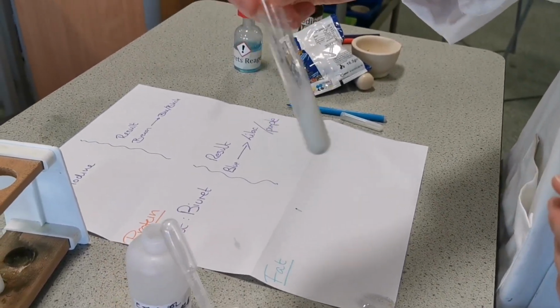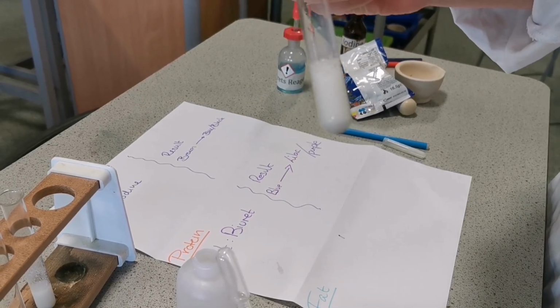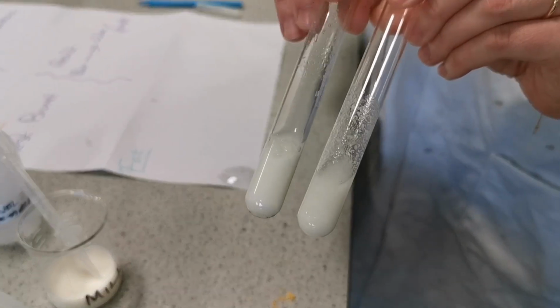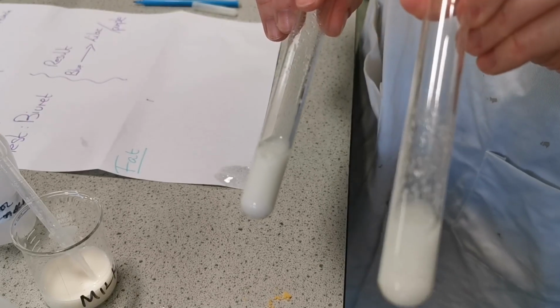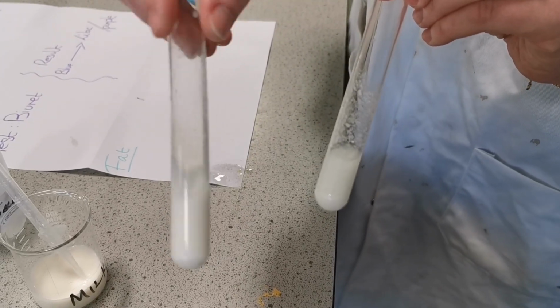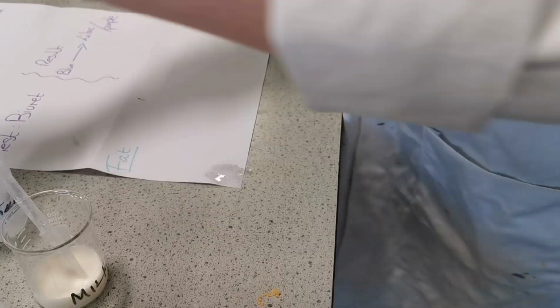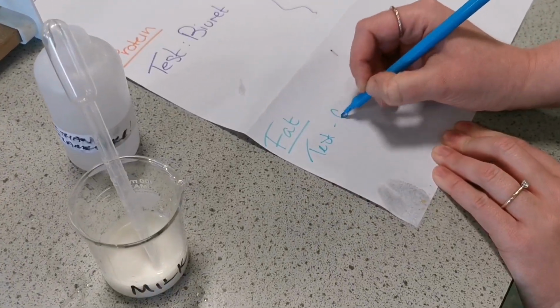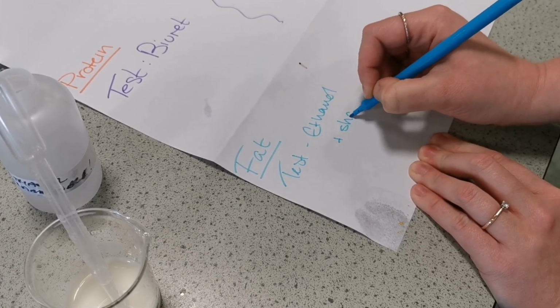Give it a good shake, and we can see that it's not sticking to the sides of the test tube like the first one did. So this is a positive test result for fats, and this is what we call a control. We're making sure that it wouldn't have happened anyway.